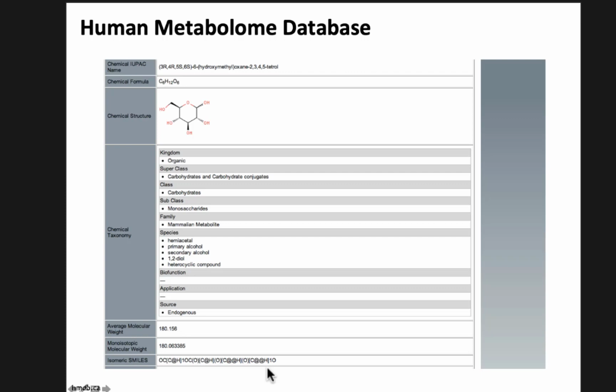This is the so-called SMILES, and that is a string representation of a molecular structure. That's something that you might know from cheminformatics, if at all. That's how structures in large compound databases can be stored. It's not the perfect way to do it, but it's one way to do it. And actually, if you copy and paste this SMILES, you can also visualize the structure in KNIME. You just copy the SMILES to a table, convert that to a structure in the way I showed it yesterday in the workflow, and then you can directly see the structure in KNIME.